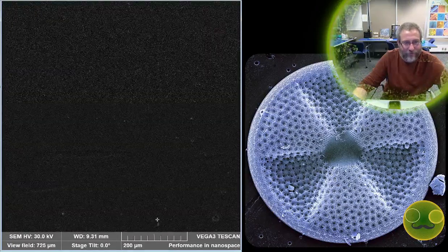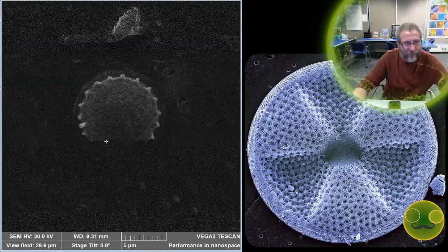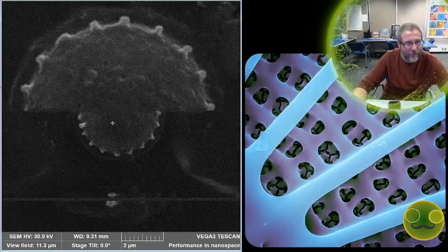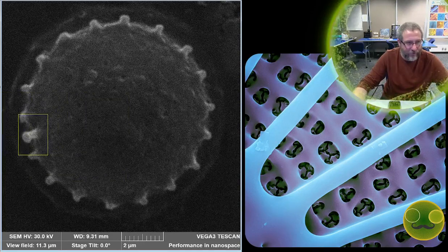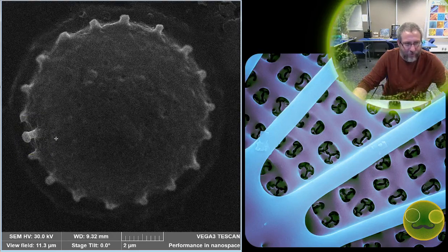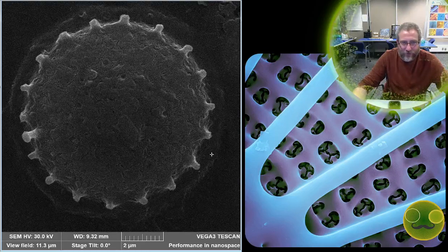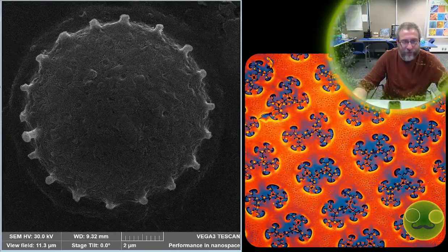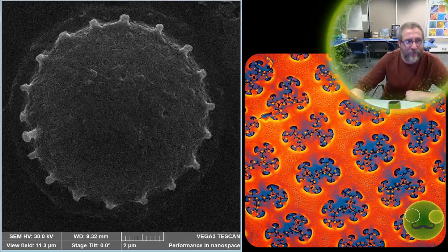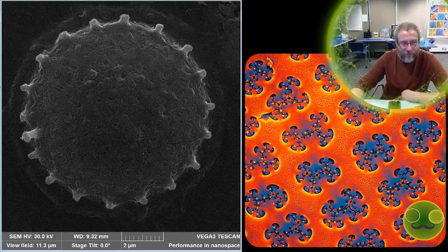I don't know that it's necessary to relay it, but here's an example of an external view. This one's got a little bit of junk over the surface, so you can't see most of the features very well. But you can see, so these are the little strutted processes. This is the way they look on the outside of the diatom. They're like little structures standing up off of the edge, right on the corner, at the mantle and valve face shoulder or junction. And then this is the external expression of the rimoportula.